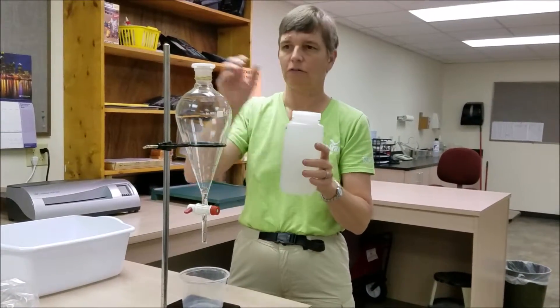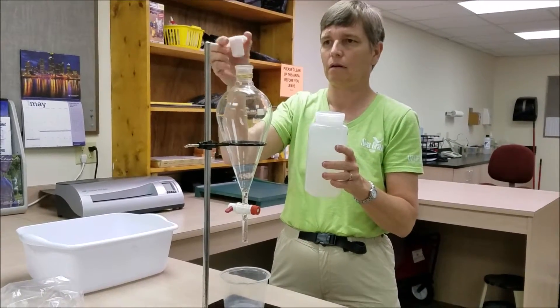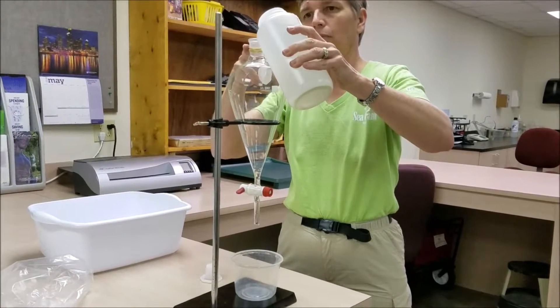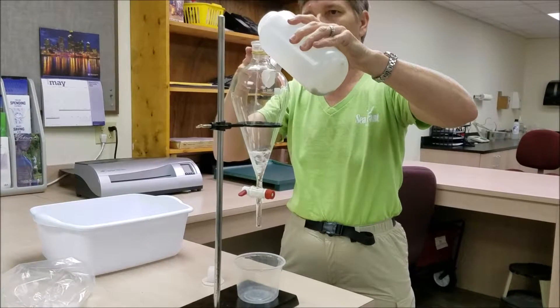I'm just going to go ahead and shake it up, get all of that sand suspended, and carefully pour the sample into the separatory funnel.